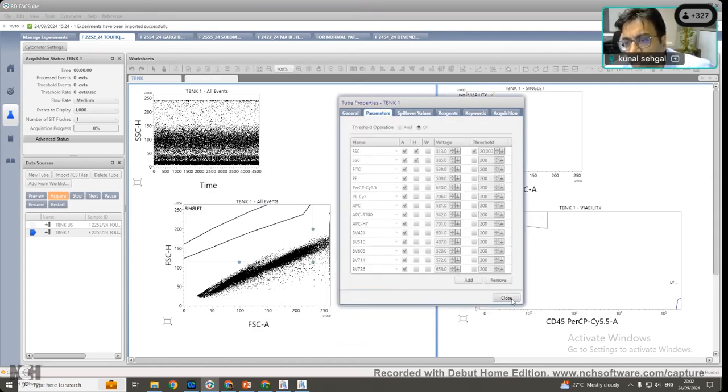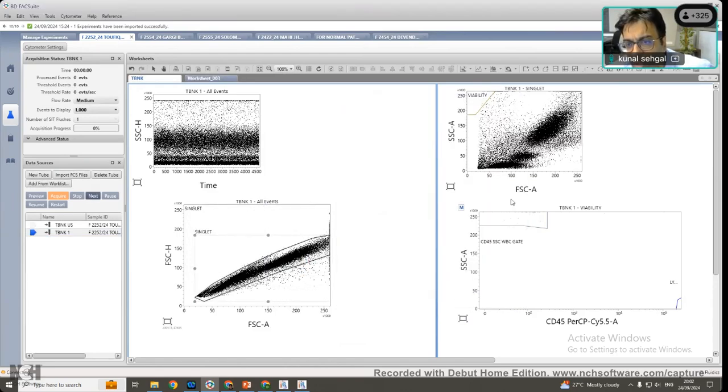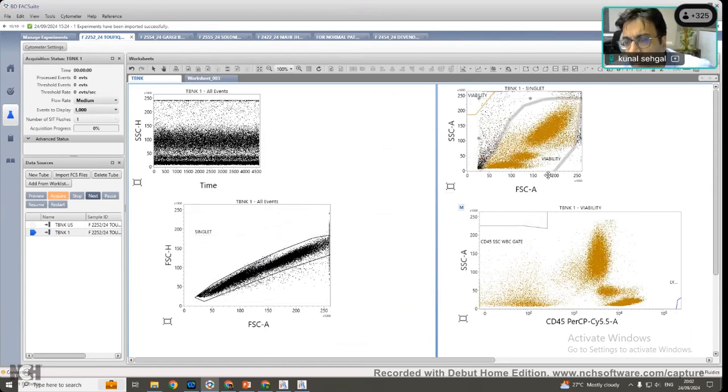It is very important to know the color I put in the diagram over here. For example, this brown color on these cells has no connection to the color of the fluorochrome or to the multicolor experiment. This color is like drawing on a piece of paper. You can choose the color you want. So that is some basics which you should know.